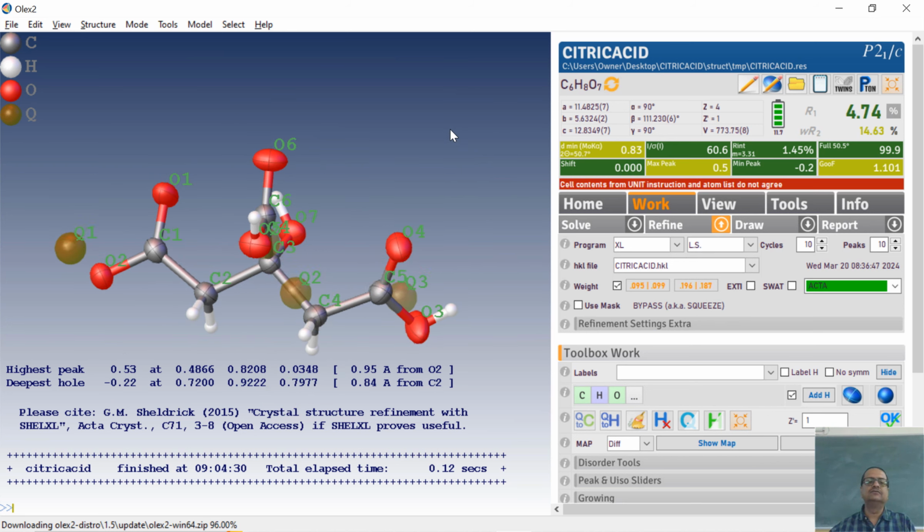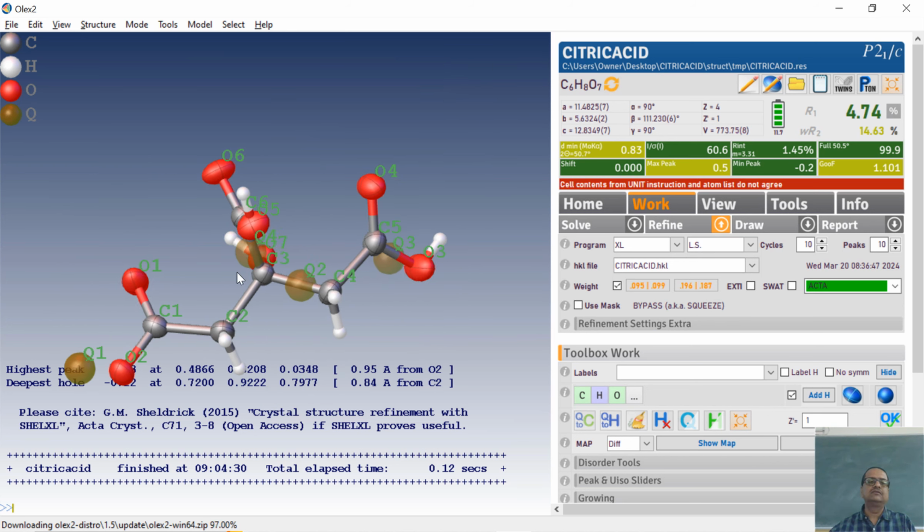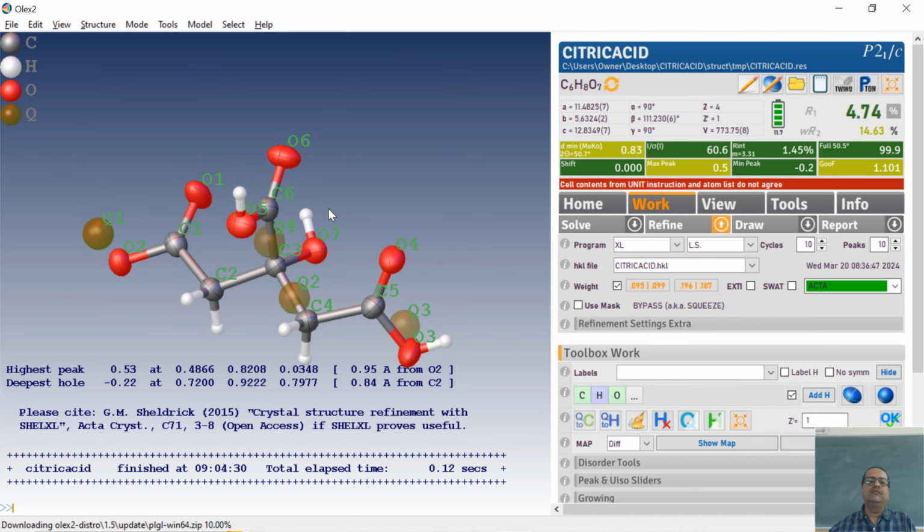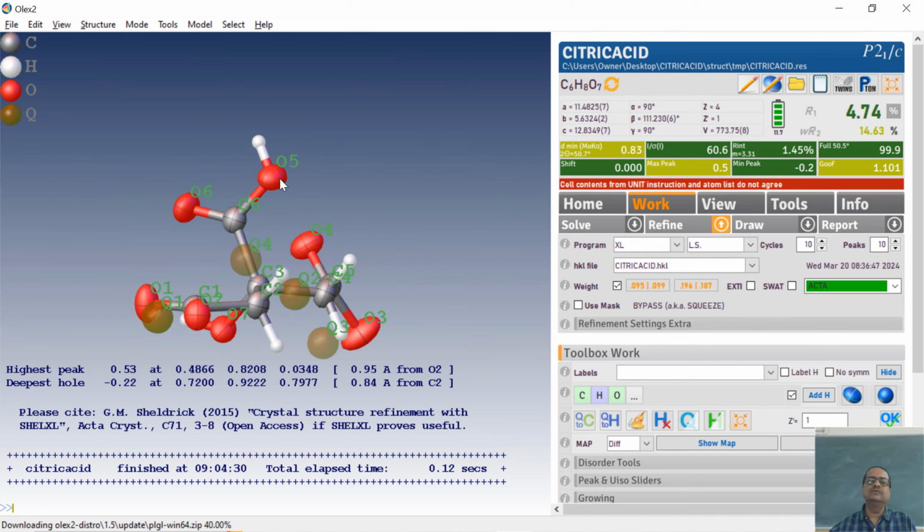See what it could not do. It could not fix the hydrogen on that, but it is giving you a Q value. So suppose it was not giving the Q value. How to fix hydrogen on that? One has to look at how it did fix hydrogen here.